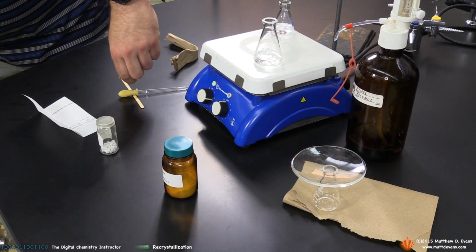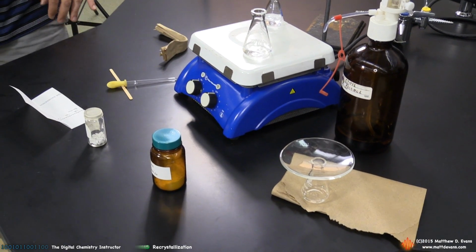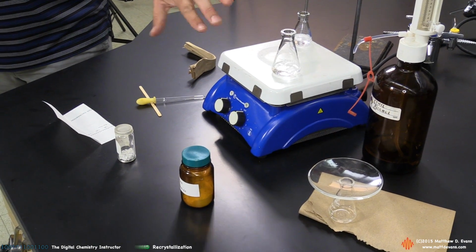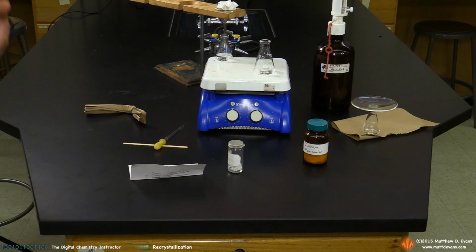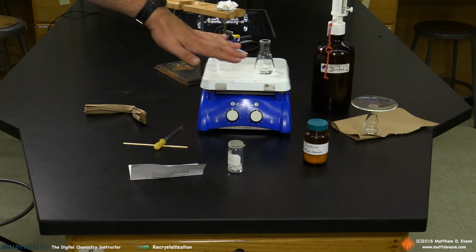And in the meantime, I'm going to turn off the heat because I don't need this anymore. But don't throw away this solvent. We're going to use this again eventually to rinse the crystals. And I'll show you that step. That's the Buchner funnel step. But otherwise, don't throw this out.